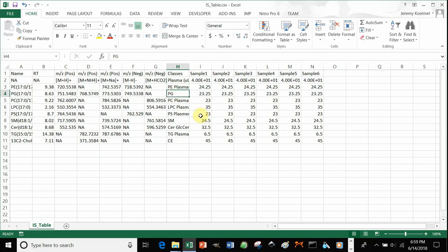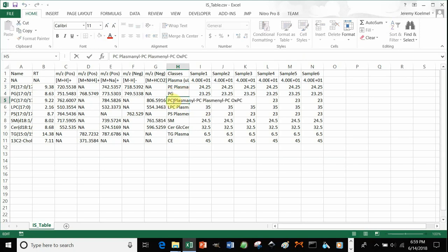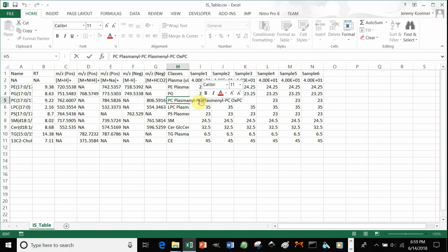For PG, you can see we have a single internal standard. Note that if you have multiple internal standards, they're each separated by spaces, and that you shouldn't have spaces in the name or acronym of your class.